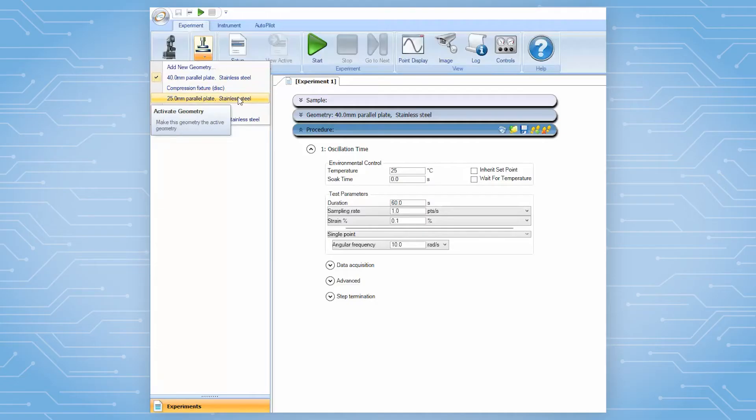For shear testing, the operator should select parallel plate geometry. Then, the instrument will move under shear deformation mode.